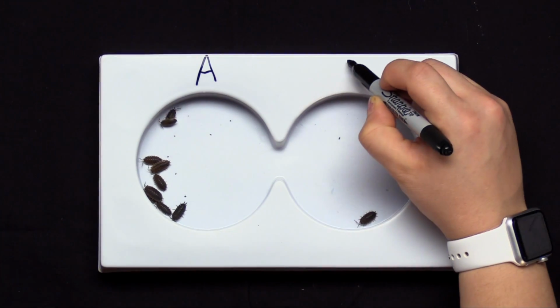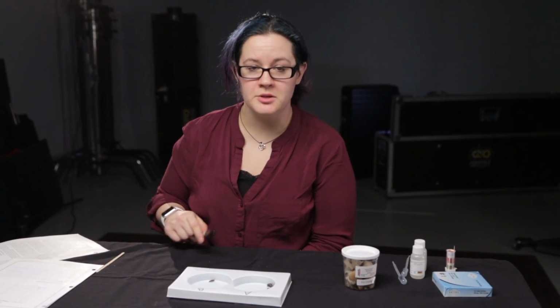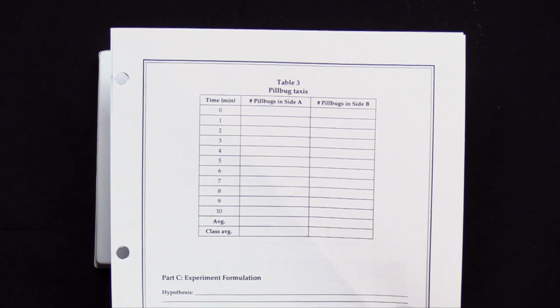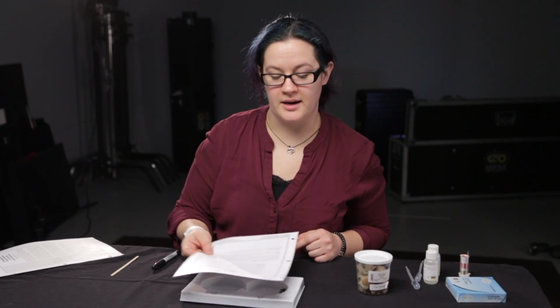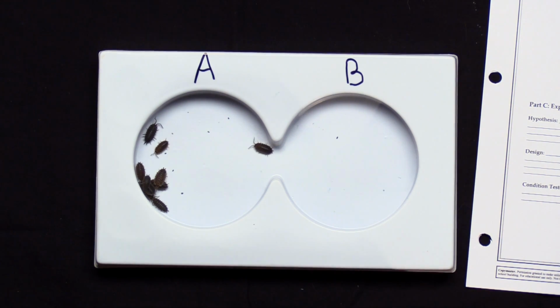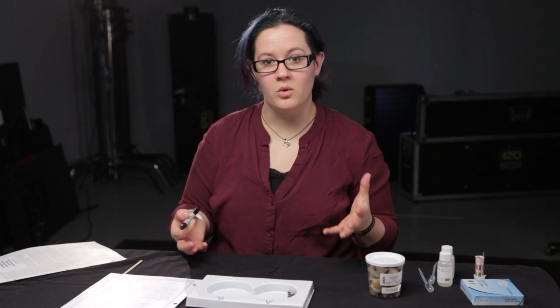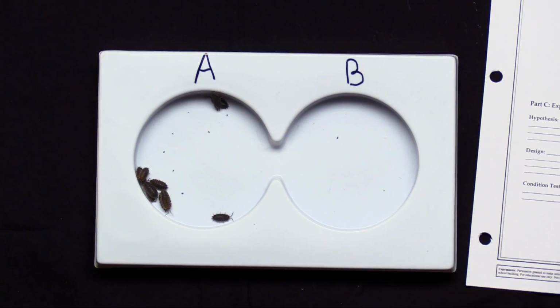I'm going to label one side of the container A and one side of the container B. And we are going to observe them for 10 minutes total, and each minute we are going to use a data sheet here where we count up how many pill bugs are on side A and how many are on side B. So to start with, there's 1 inside B, and then 9 of them are inside A. I know that he moved, but as a quick, instantaneous measurement, I'll say that there was 1 inside B and 9 of them inside A.